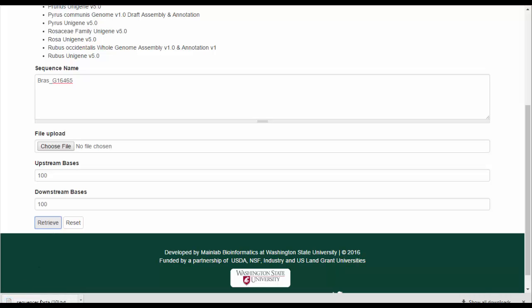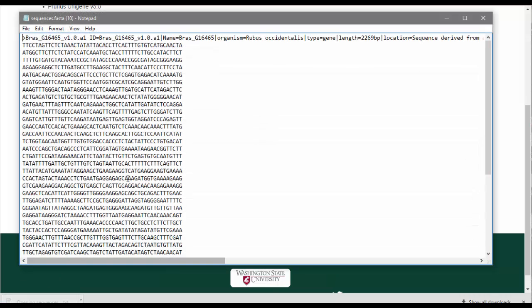The genome sequence with flanking base pairs is returned in a text file in the FASTA format.